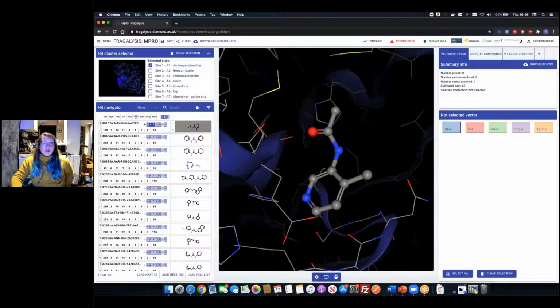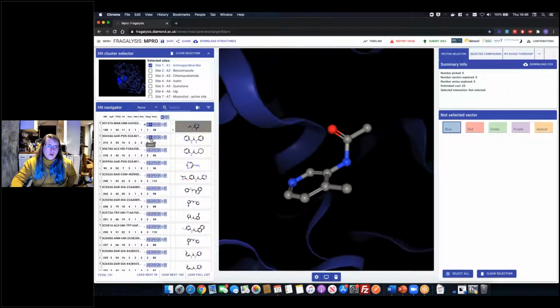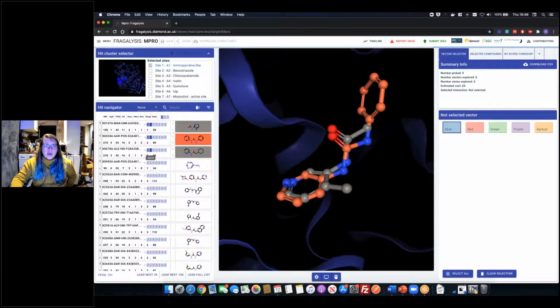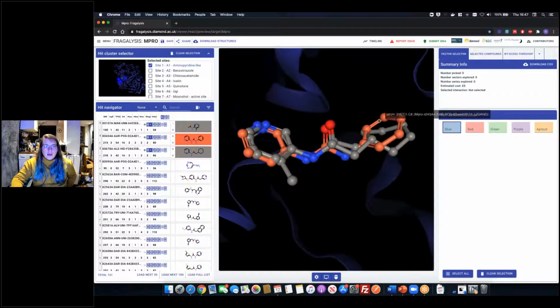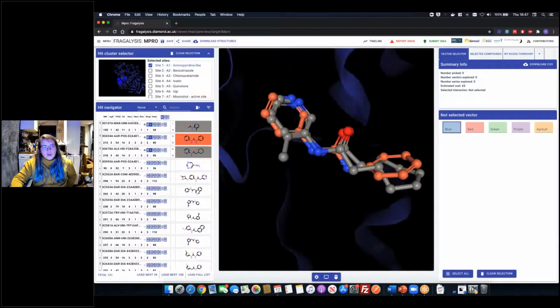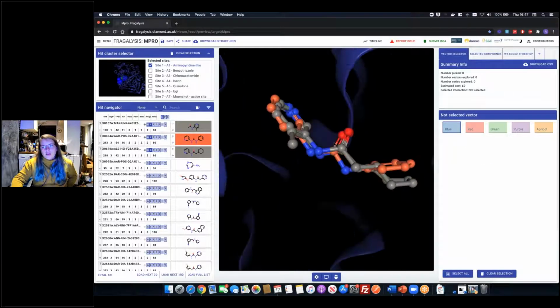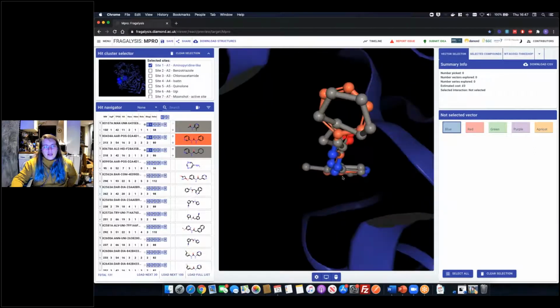Okay, so when the page first loaded, I'm sure you will all see there was a ligand turned on. One of the best things about Fragalysis is that when we're looking at those sites, we can start to overlay molecules together and see what sorts of things are quite common. You could look at it from a ligand point of view and look at these molecules and say, oh, there's a whole bunch of fragments that have this oxygen atom and the ring systems on either side.